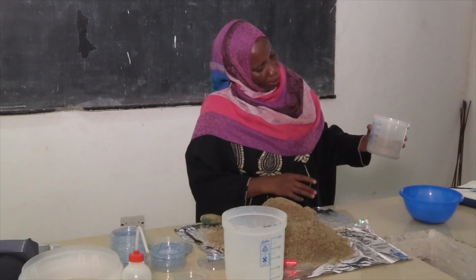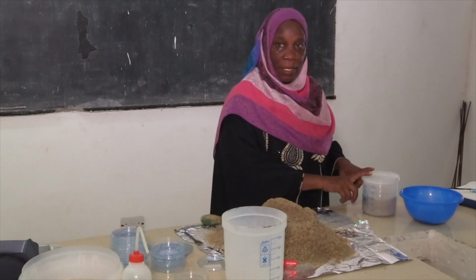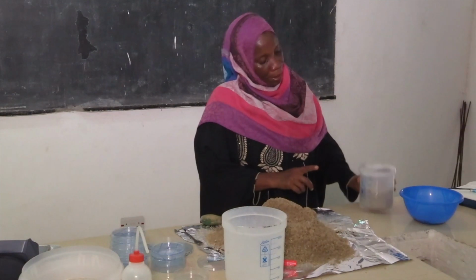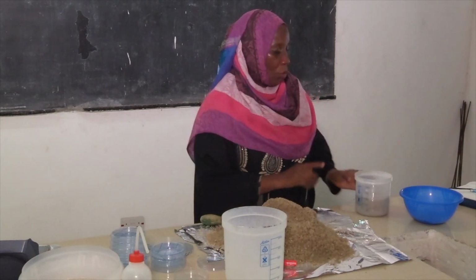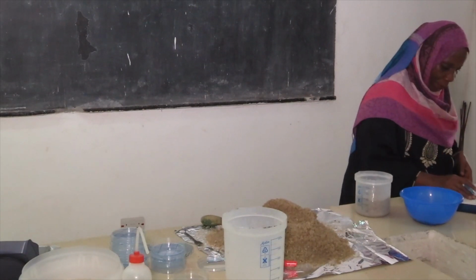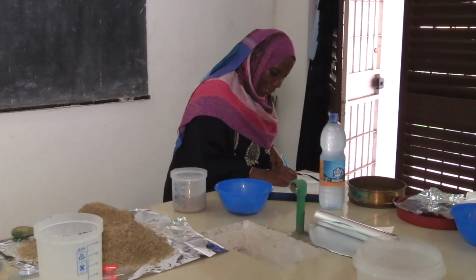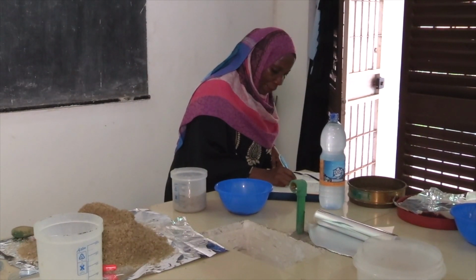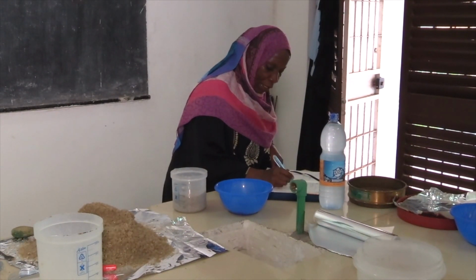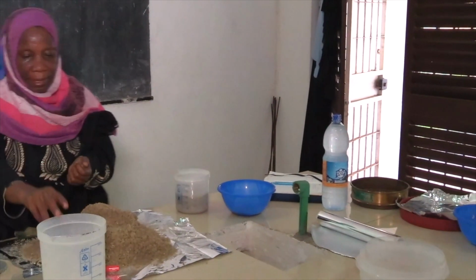And so it's about 600 mils. So this is 1 kg, the volume is 600 mils. So count it. Replicate 1, 1 kg, 600. Okay. Then we take all the rest here.